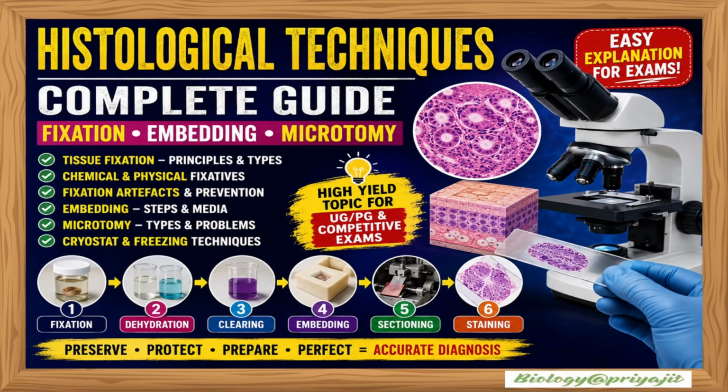Imagine observing a tissue under a microscope hours after removal. What happens? The cells start self-digestion, bacteria cause decomposition and the tissue structure gets destroyed. So how do scientists preserve tissues in a lifelike state? That's where fixation, embedding and microtomy come in, the foundation of histology and histopathology.